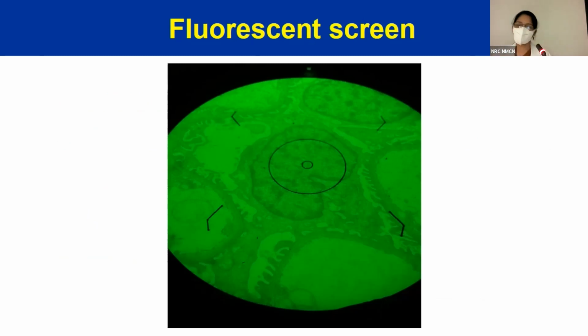So if you look at this image, this is an image of what? What is the tissue which has been kept in the specimen sample? So, give me the part. What is the part? Glomerulus. Very good. So these are the foot processes. This is the glomerular basement membrane, and these are the capillaries, the capillary lumen of the glomerulus, right? So these are glomerular capillary loops, right? And this is a podocyte, which is sending its processes towards the glomerular basement membrane.